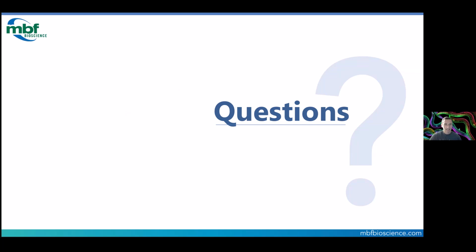Can we send you data for interpretation purposes? We are always happy to work with our users, and we are constantly having a transfer of information back and forth, whether it be videos for parameter optimization or taking a look at analyses to see what will help you best answer your research questions. So absolutely, we want that dialogue with you.